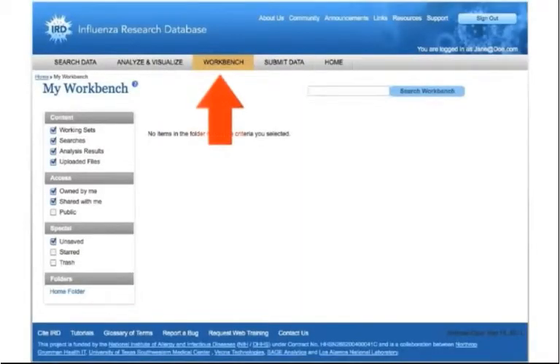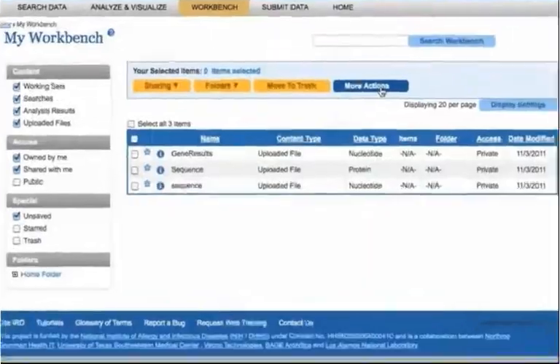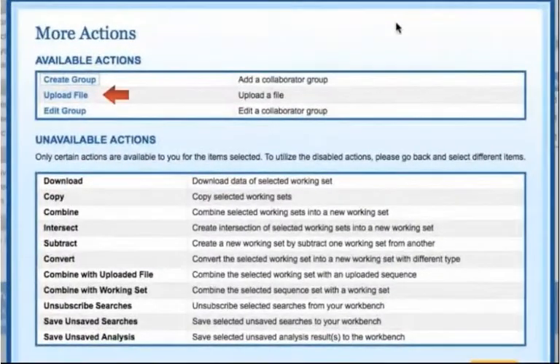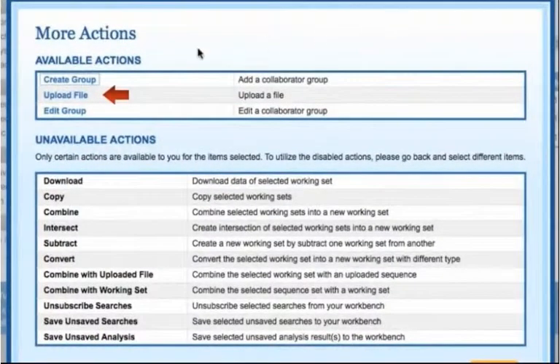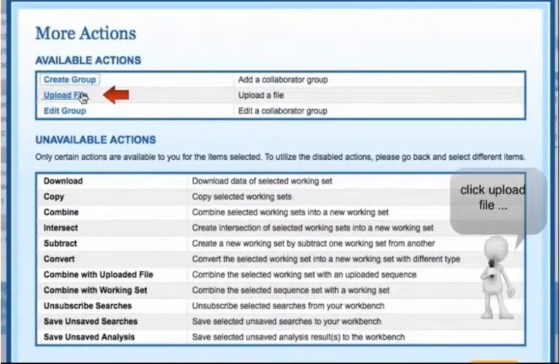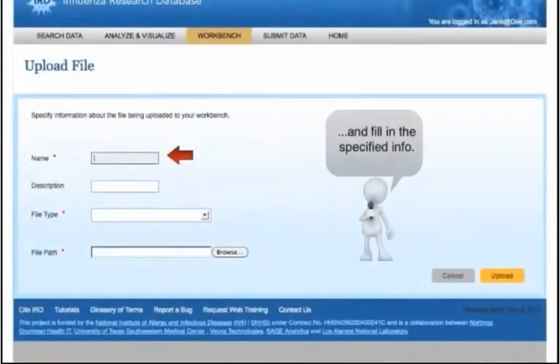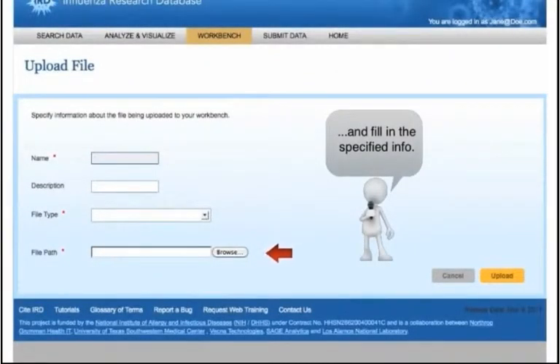To do so, navigate to the Workbench page and click the More Actions button. Click the Upload File button, then type in a name and description for this file to be visible on your workbench.